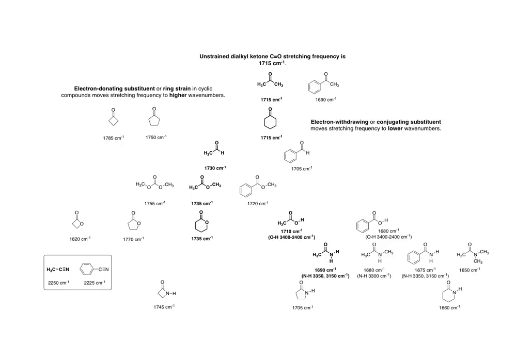This chart shows a large number of carbonyl compounds. As I mentioned earlier, there are two important numbers to remember in infrared spectroscopy, in addition to 3,000 wave numbers for the boundary point between sp2 and sp3 carbon-hydrogen stretches. Acetone and cyclohexanone have a carbonyl stretching frequency of 1715 wave numbers. And 1715 is the second number that you should know for infrared spectroscopy.